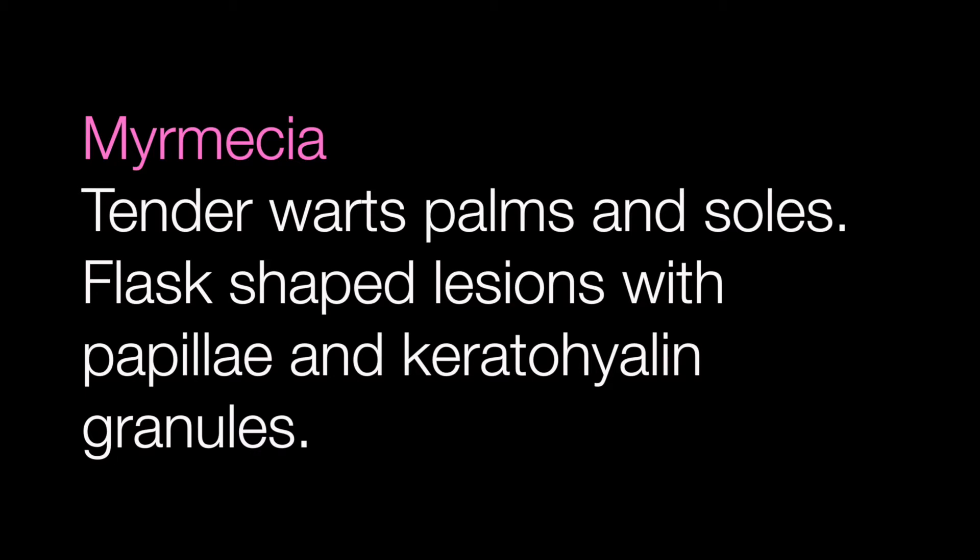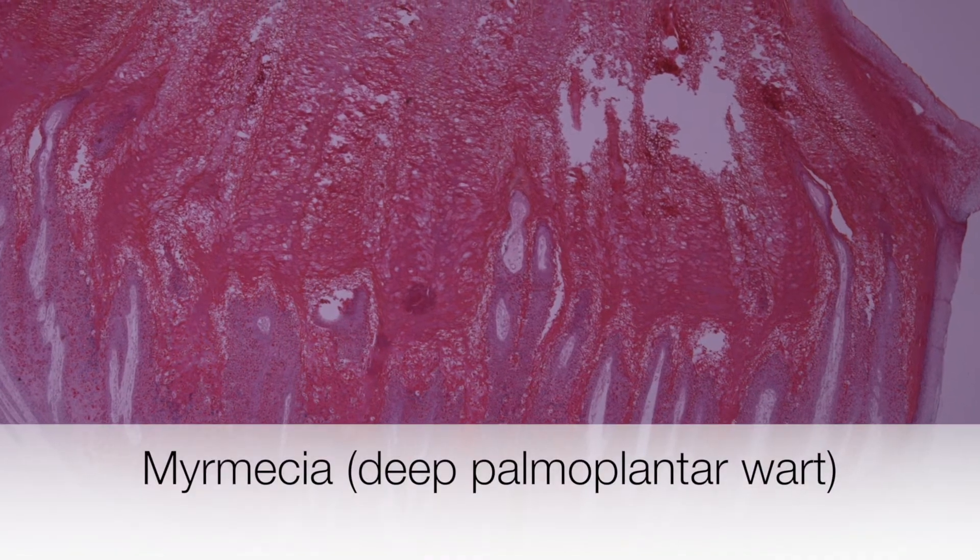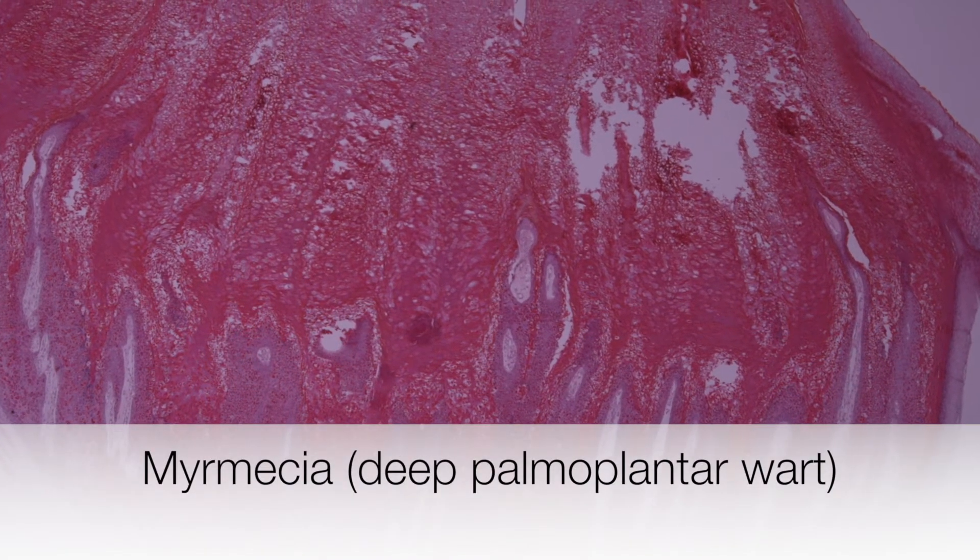Histologically they are flask shaped with papillae and keratohyalin granules. Looking at the lesion on low power allows you to appreciate the flask shape. The higher power views demonstrate the papillae and also the keratohyalin granules.